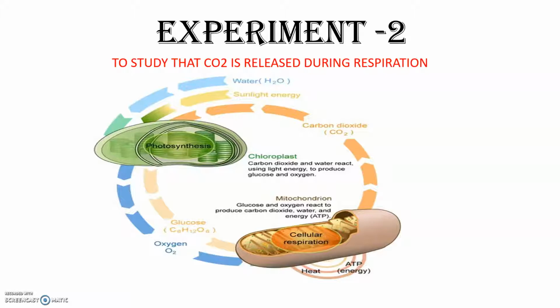Last time we discussed experiment number 1, to observe stomata in the leaves. Today we'll be discussing experiment number 2 of biology, which is to study that carbon dioxide is released during respiration. First of all, let's discuss in general what is respiration.